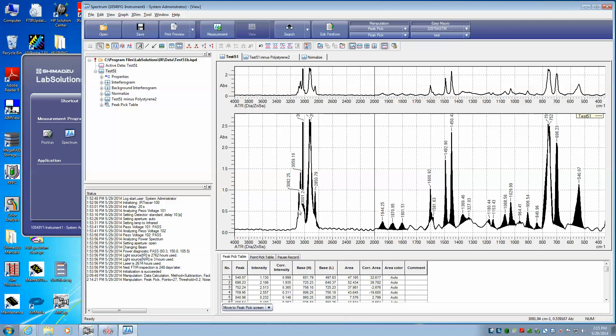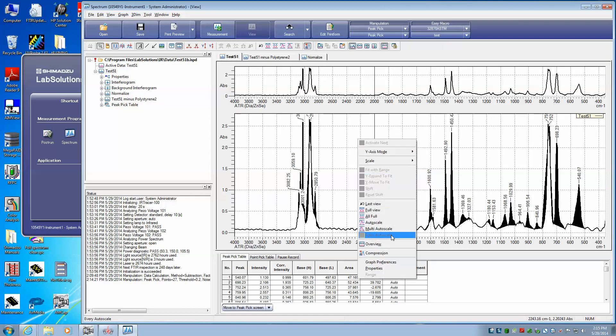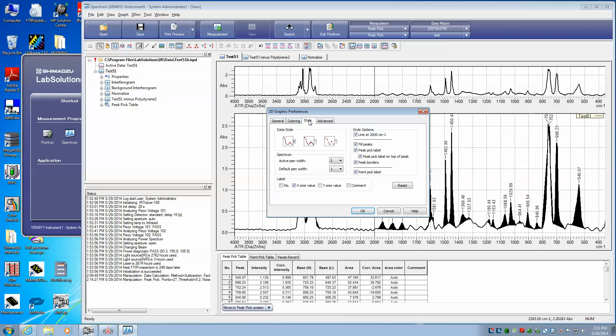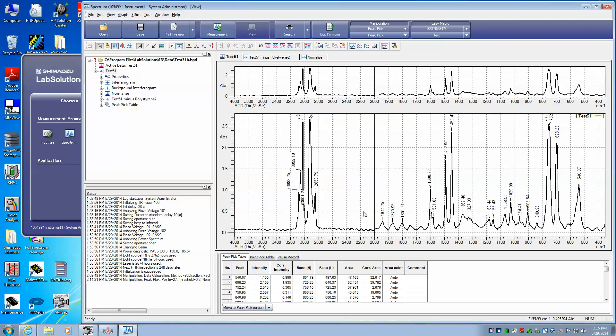We would have to adjust the threshold and the noise in order to have these peaks filled properly. So I'm going to remove that now again, right-click on the graph, Graph Preferences, Style, and un-click Fill. And that is how we pick peaks.